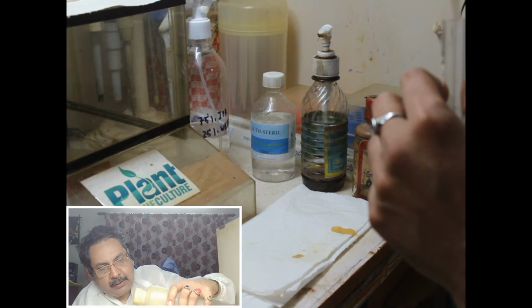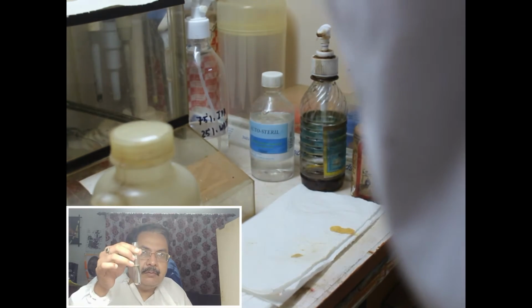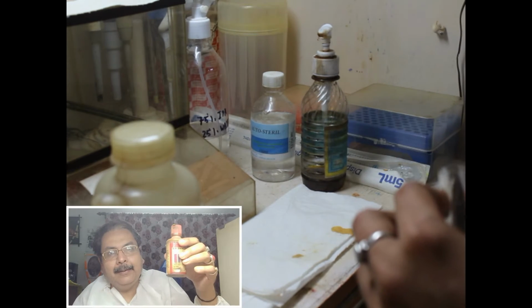So this is distilled water. We are taking distilled water in the test tube. Now we are going to add a reagent.